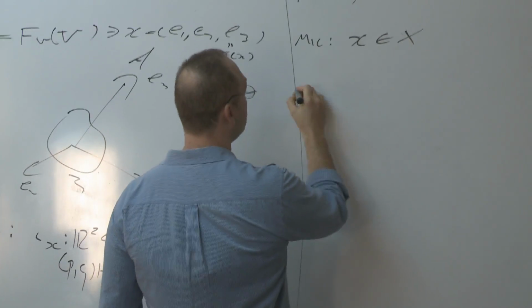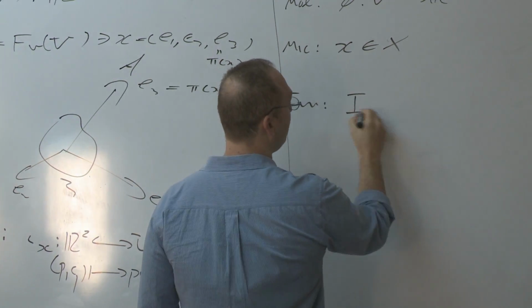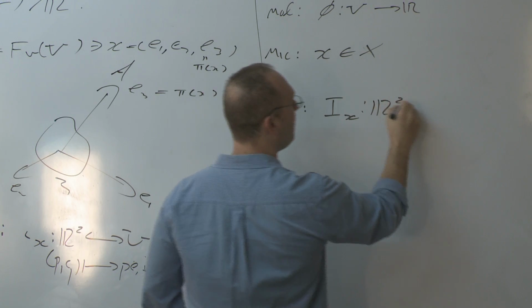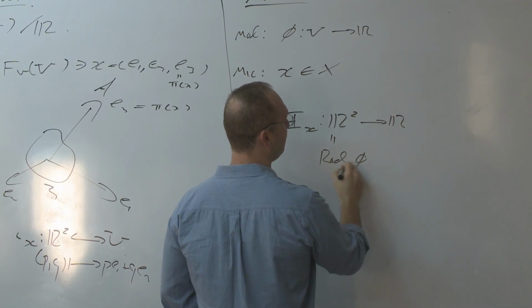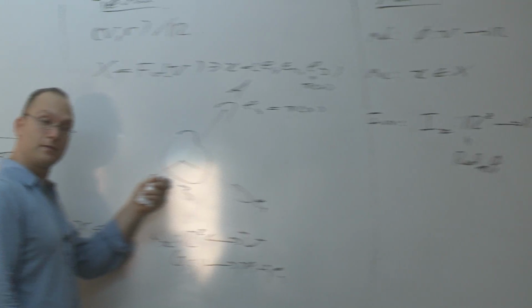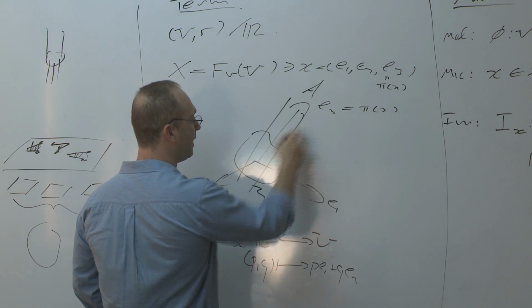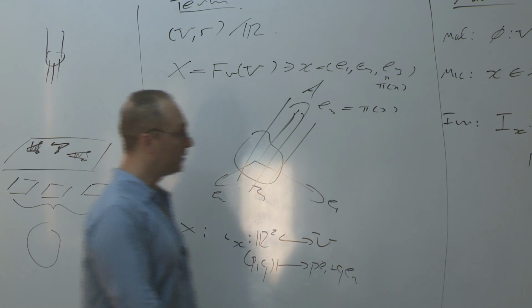And the projection image that you pick up when observing the molecule from an orientation x is a real-valued function I_x on the coordinates of the camera, which is given by the Radon projection of the potential function along the viewing direction. So pictorially, the intensities of the pixels are correlated with line integrals along lines which are parallel to the viewing direction. So this is how the image is modeled mathematically.